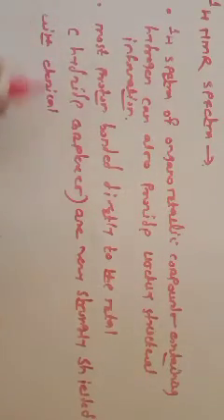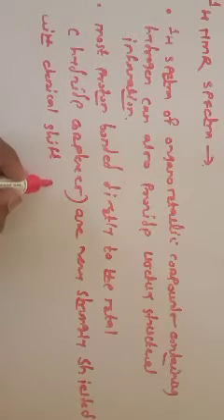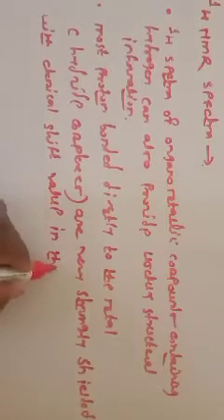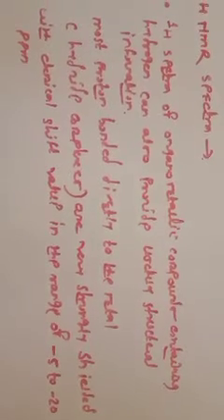For the proton directly attached to the metal atom, the chemical shift value is in the range of -5 to -20 ppm. You should keep this range in mind.